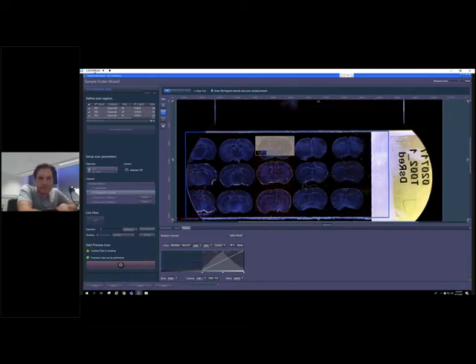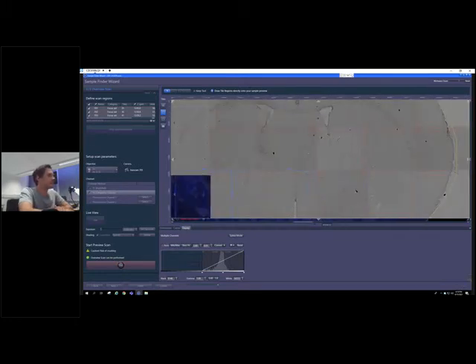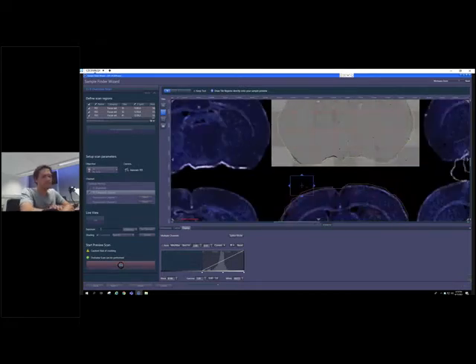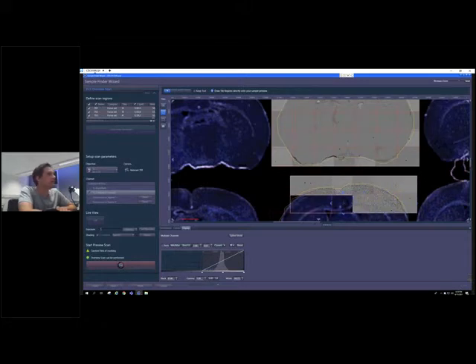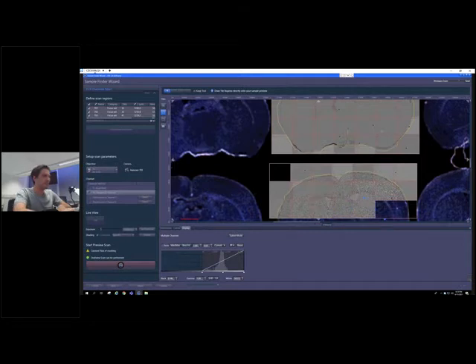And we're just running a preview scan based on this coherence contrast image with a 5x magnification on 3 of the sections here on the slide. And let me just zoom in a bit so you get an idea on how good the contrast image already is. And this could be already sufficient for us to assign further experimental regions based on morphology of the tissue sections here.